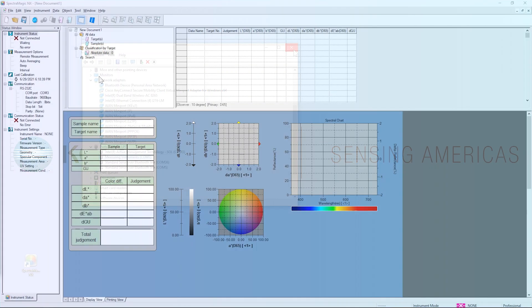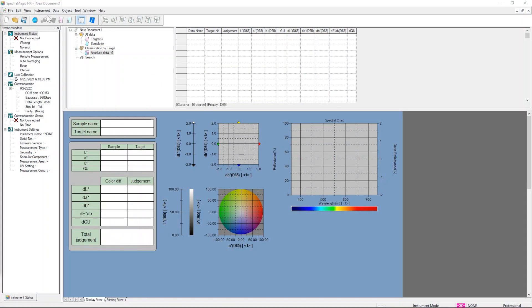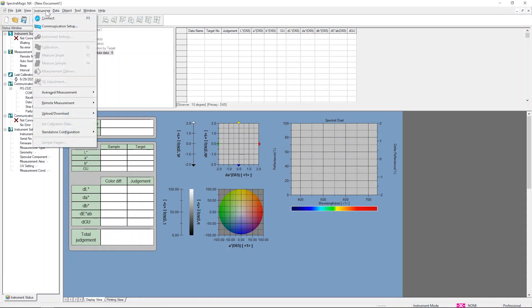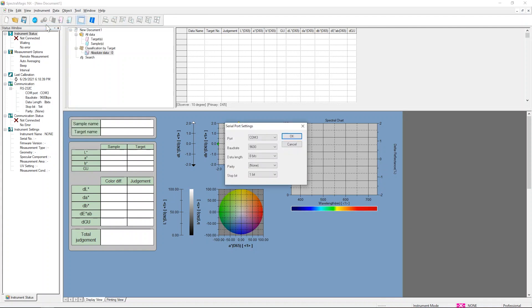Close Device Manager and open the software. Select Instrument then Communication Setup. This will open the Serial Port Setting window. From the Port drop-down menu, select the correct COM port. Leave all the other settings to default and click OK.